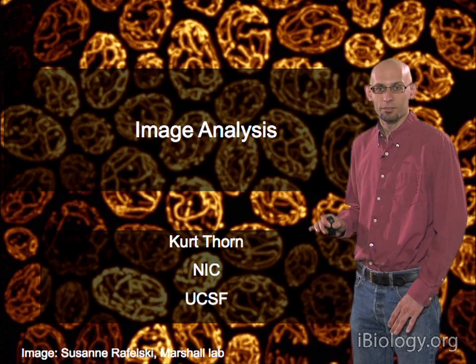And how this works is, here's, say, a little 5x5 image we want to filter. So we take our 3x3 kernel here. We then drop it on this 8 here. And so now we go through one by one, and we say, OK, here's 10 times 1 is 10. 11 times 1 is 11, and so on. And we multiply our way through and add these all up. And eventually, you get the value 14 out of that. And so you would go in here and then replace that original 8 with 14, because that's the average of these 9 pixels.